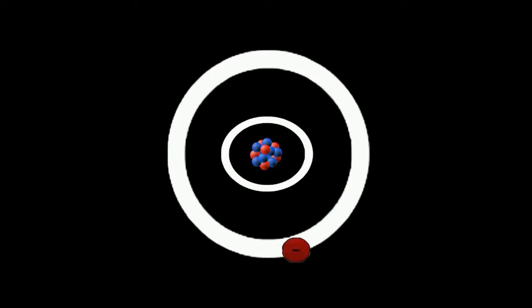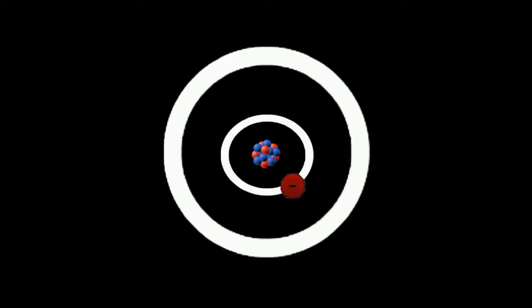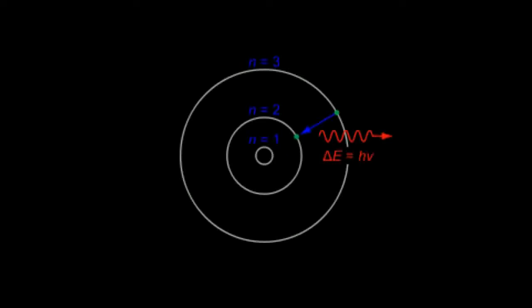In order for the electron to return to its most favorable state, the electron will drop back down, releasing the energy in the form of a photon. That photon has a specific wavelength that corresponds to a form of electromagnetic radiation. Lambda max is determined by this specific wavelength. Each substance will have its own individualized lambda max, as each substance will require different amounts of energy to excite electrons to a different energy level.